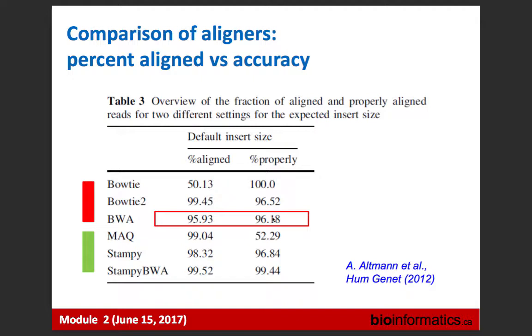They were pioneering experiments, but we had to accept the fact that the sequencing platform was not good. So we were losing a lot of reads, but there were still some useful reads. So nowadays, of course, if you are somewhere below 80%, let's take your number, you should worry a little bit. You should look at those reads which are not aligned. Of course, whether it's good or not, you will see only after analyzing your data.